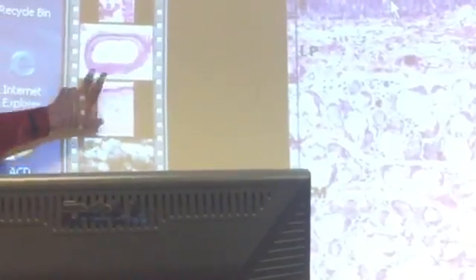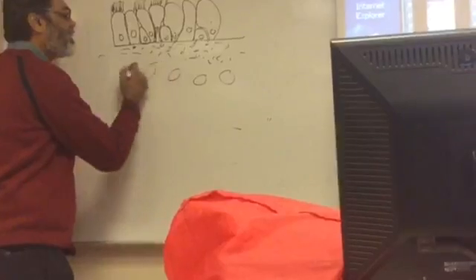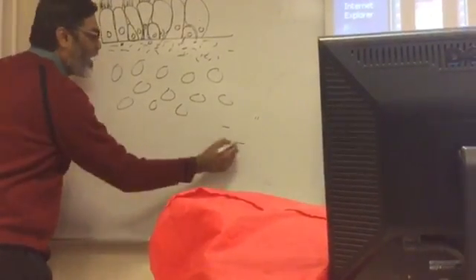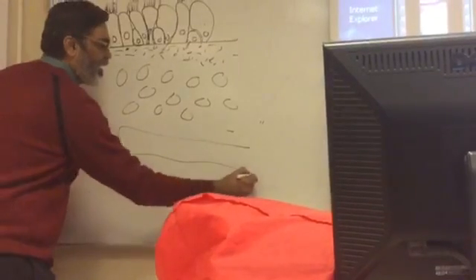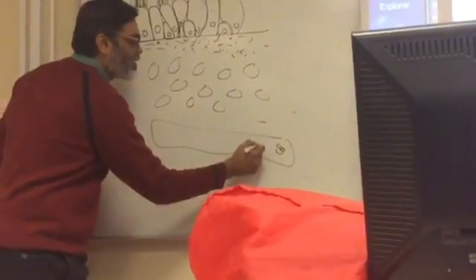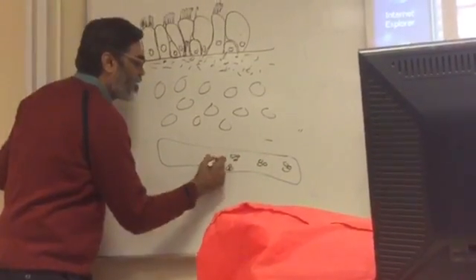And in the gap here we have smooth muscle. Maybe we have a cartilage here, we have glands, and then we have cartilage. So we have a hyaline cartilage here, with cells and ground substance together.